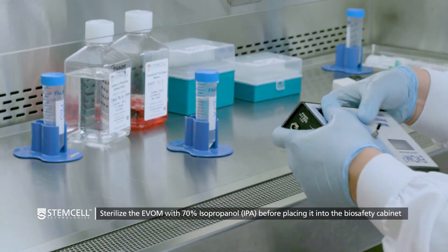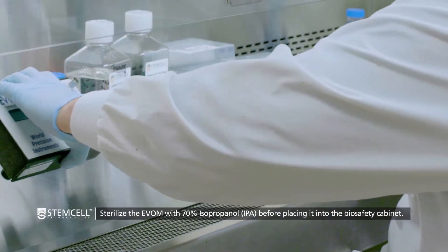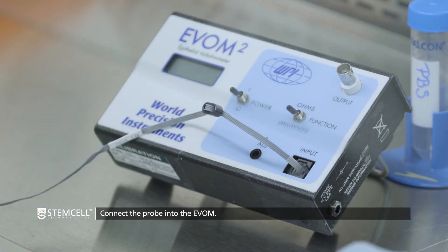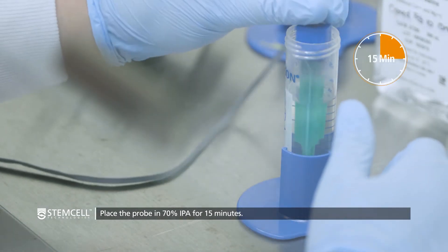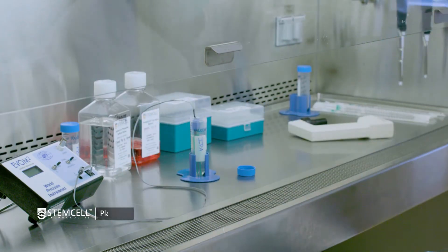To initiate a TEER measurement, first place the EVOM and probe in a biosafety cabinet. Plug the probe into the EVOM by means of the modular connector. Sterilize the probe by submerging the green prongs in 70% isopropanol, or IPA, for 15 minutes.